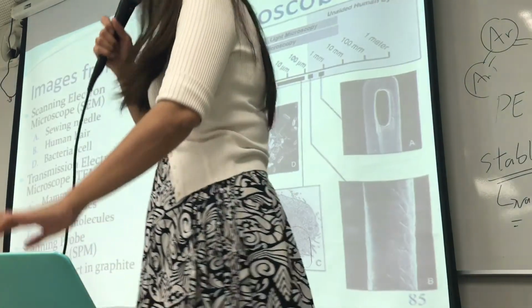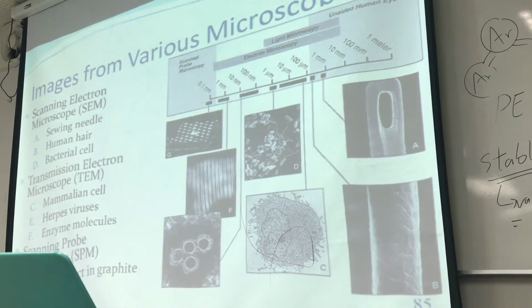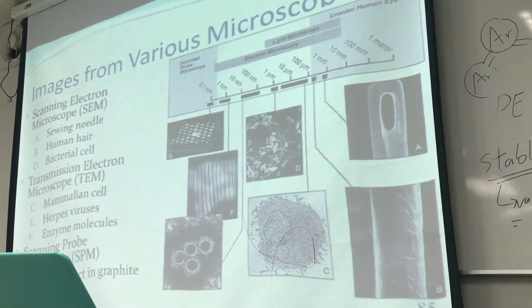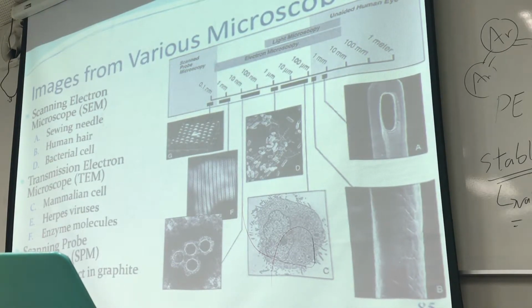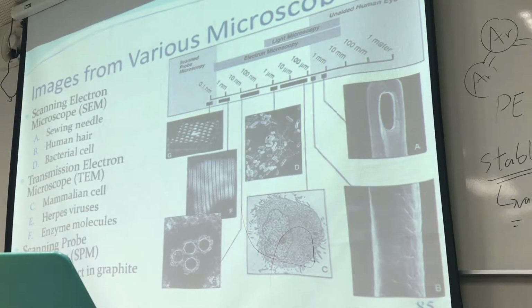Alright. Actually, this one, the next slide, I don't have it. The next slide is STM, the scanning tunneling electron microscope. You will see that. For the AFM, the principle is that there is some kind of interaction between the atoms of the tip and your sample. But for the scanning tunneling electron microscope, you will see some similar features. But what is more exciting is what you see right here.